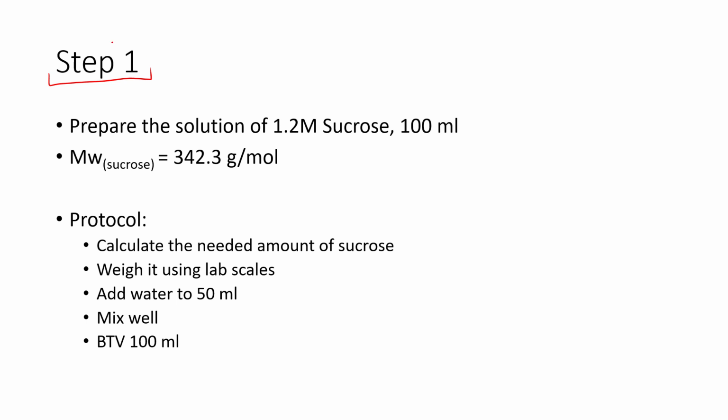During the first step you are going to prepare the concentrated sucrose solution, and it will be 1.2 mole per liter concentration, and you're going to prepare 100 milliliters. So why do we give it to you? Because in the previous lab, during the lab math, you did not see how to prepare the real solution. So in this case we are going to show how to do that.